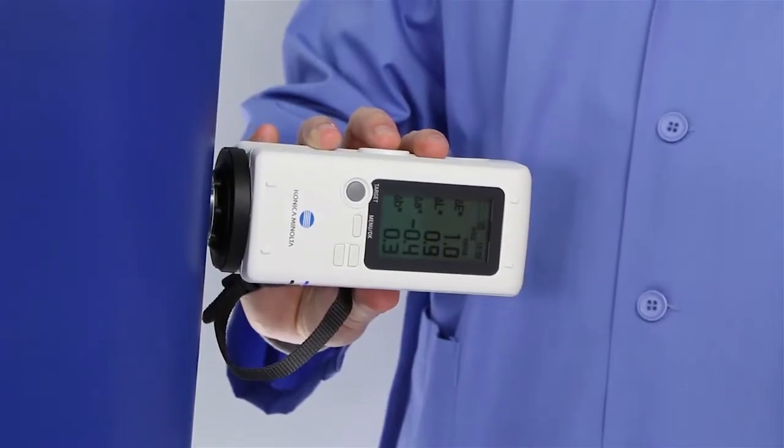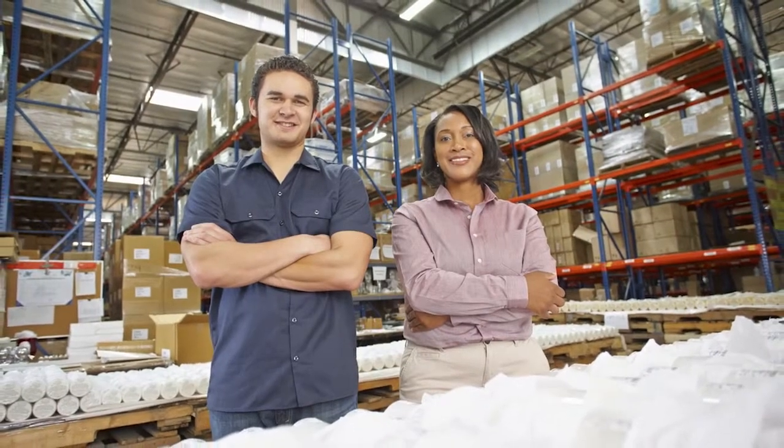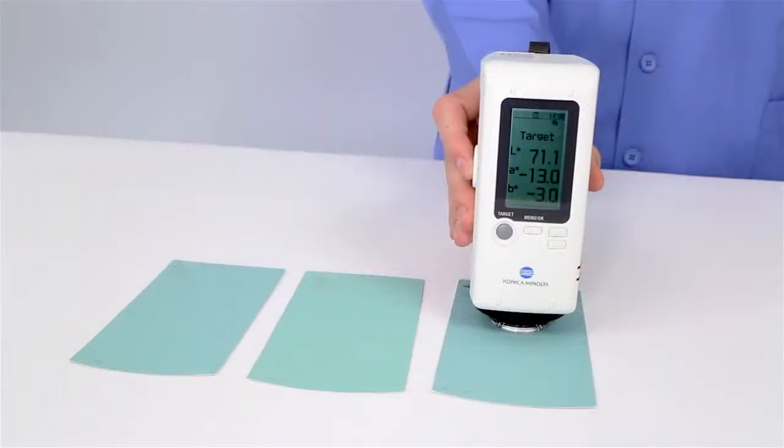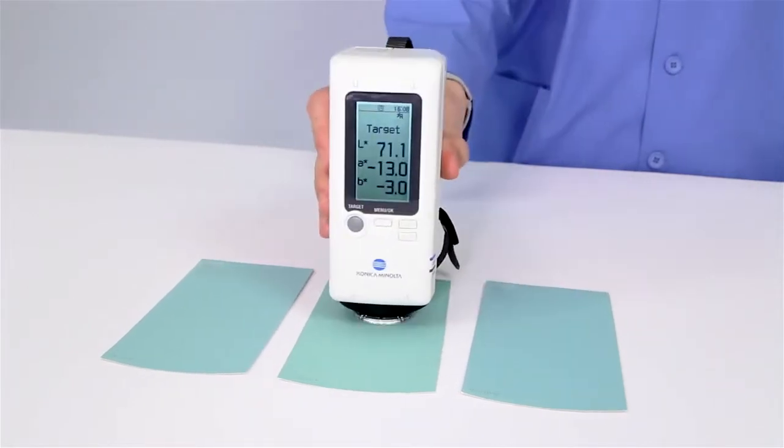and quality assurance professionals worldwide ensure consistent color. With this high-quality, low-cost instrument, you can measure overall color difference between targets and samples in an instant.